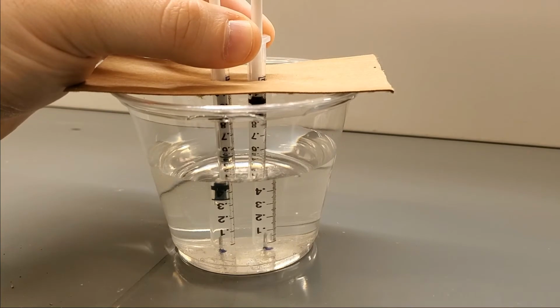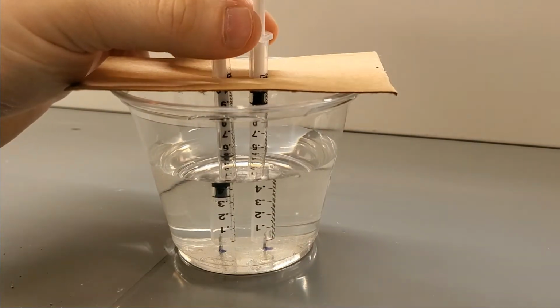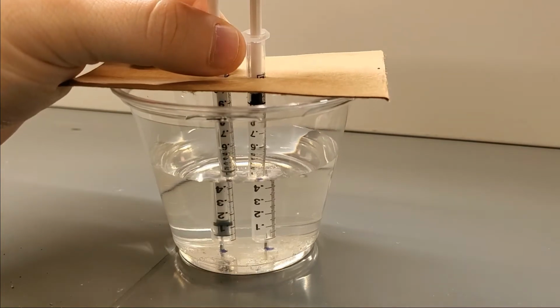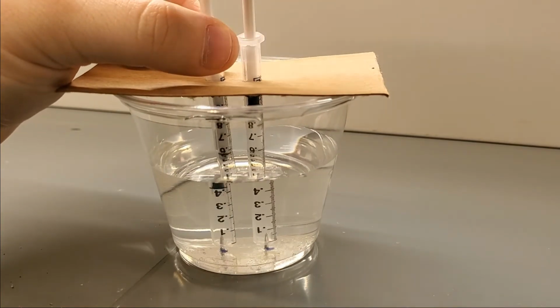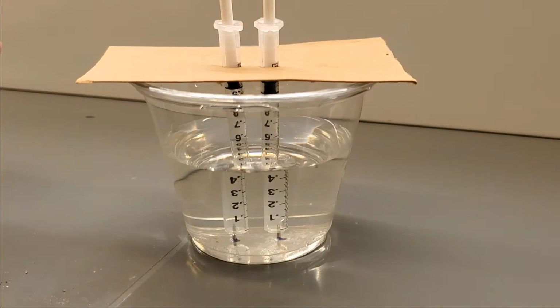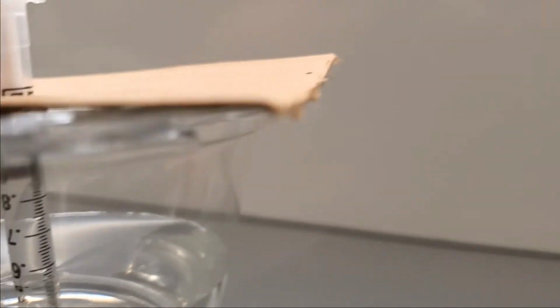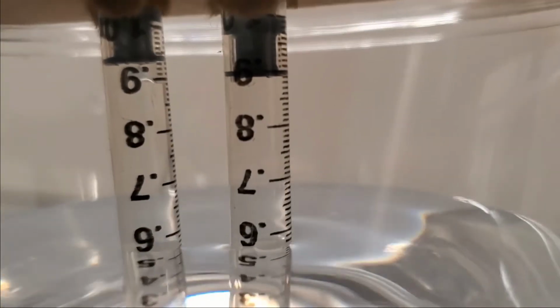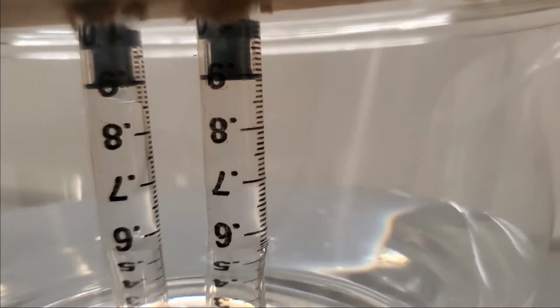Once the syringes are snugly over the thumbtacks, pull the plungers up to your starting position. Try to make sure that there's no air inside of the syringes, and if there is, you can push the plungers all the way down to try to exclude some of the air. Make a note of where your plungers are when you start. Try to get them to a nice round number. For instance, ours are starting at 0.9.